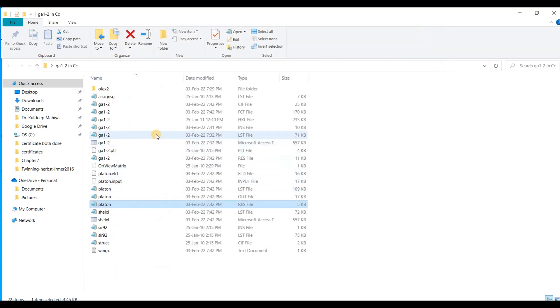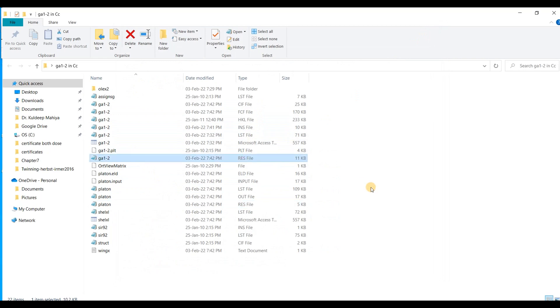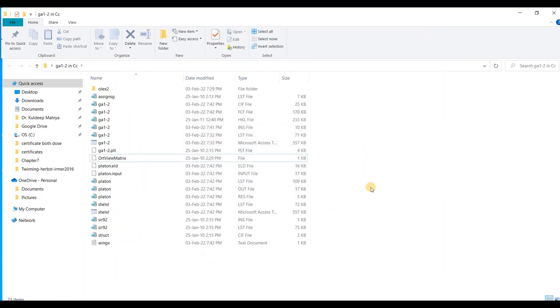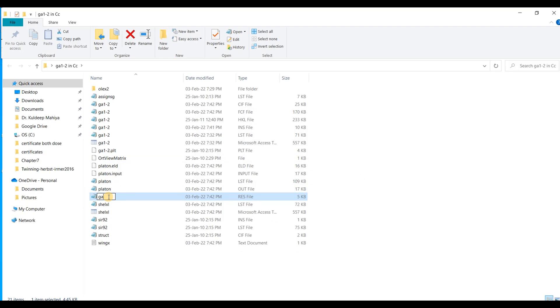So what is the, where is the old res file? Here it is, I am going to delete it and rename the new file as the old one. GA1-2. Okay.